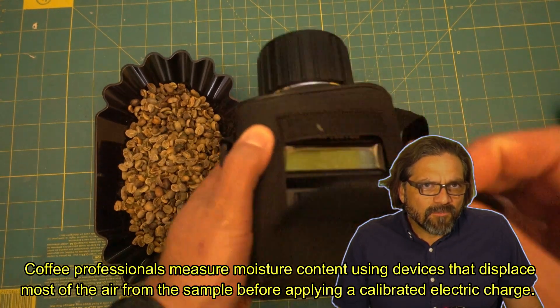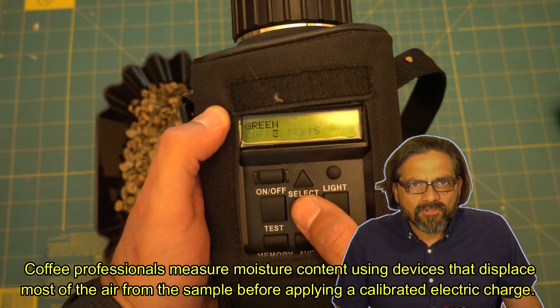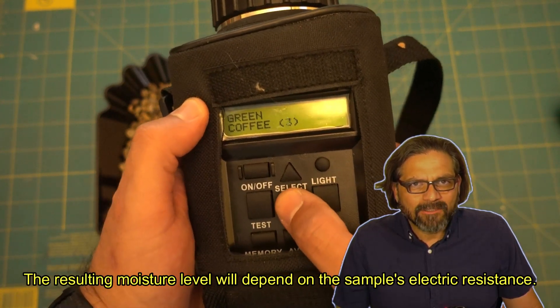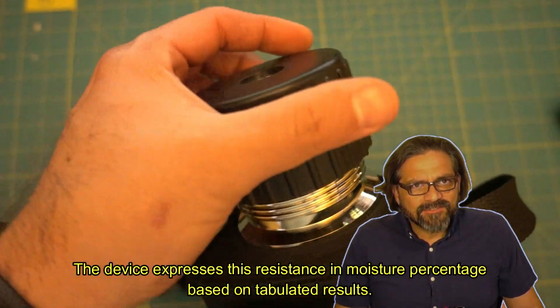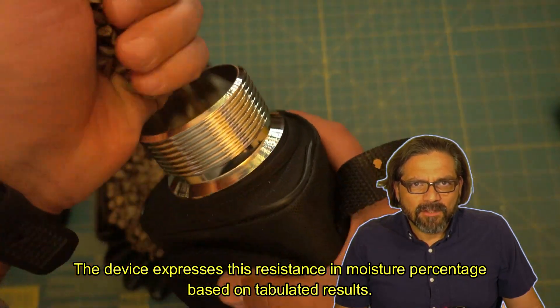Coffee professionals measure moisture content using devices that displace most of the air from the sample before applying a calibrated electric charge. The resulting moisture level will depend on the sample's electric resistance, and the device expresses this resistance in moisture percentage based on tabulated results.